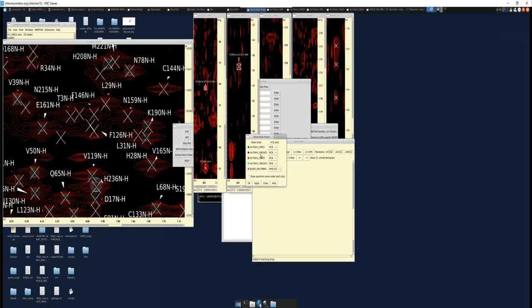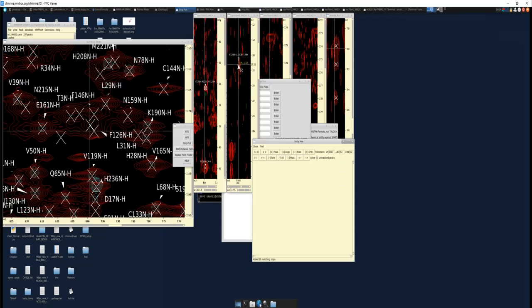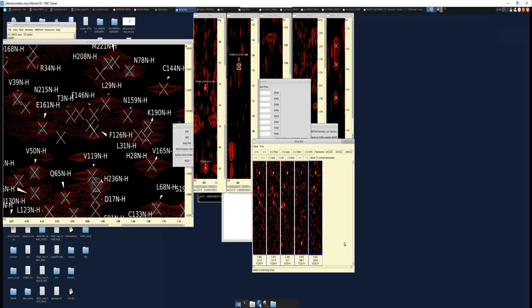Your only options here are either to just search the HNCA, which will get you 19 different matches, which is useless, or search the HNCA-CB using the C-beta, which will get you 4 different matches, and then you'll have to visit every single one and look at its C-alpha and make sure that fits. This is incredibly tedious and annoying.